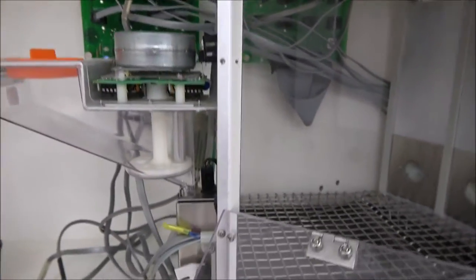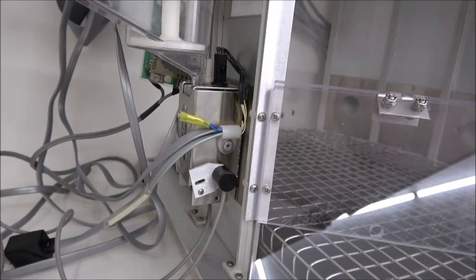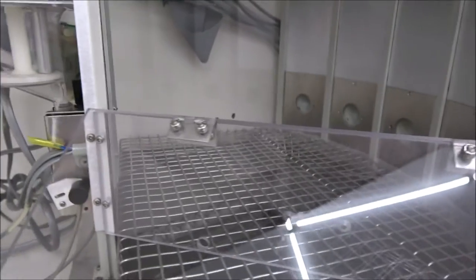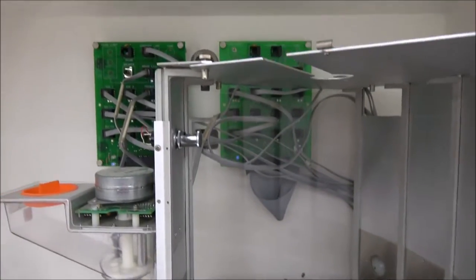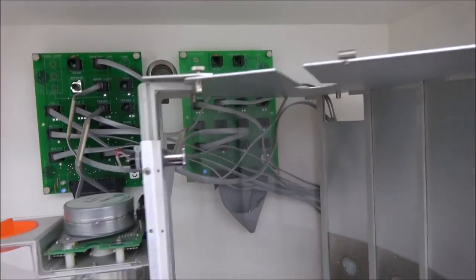The pellet feeder does have the head entry, so it does detect whether pellets came through and also if it was taken. Again, it has both two connector boards back there because you see there's a lot of connections.